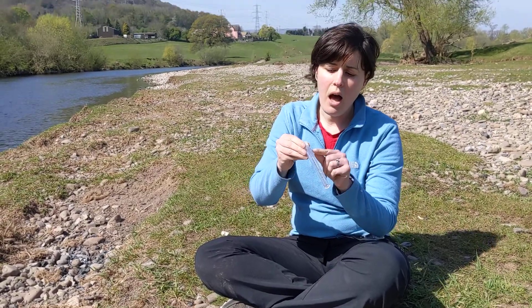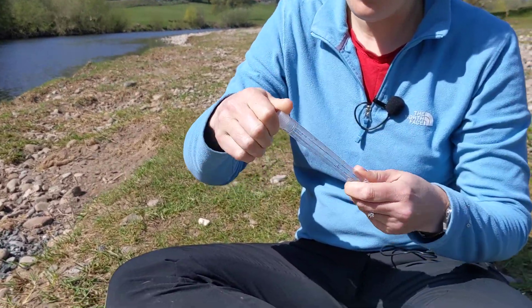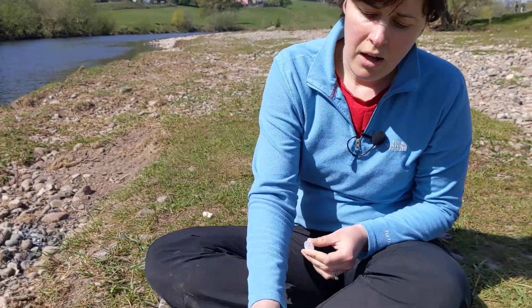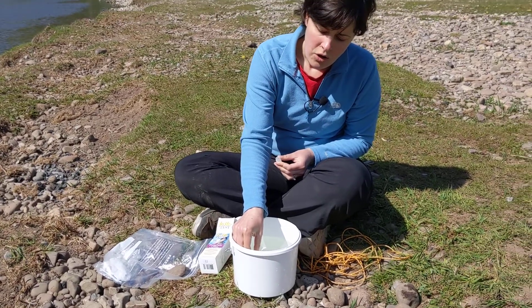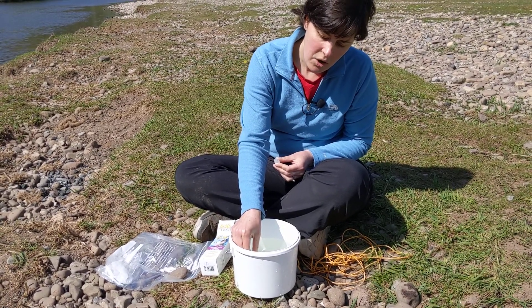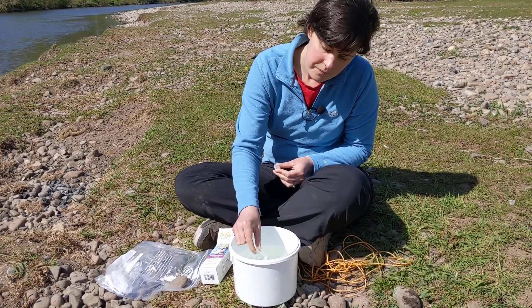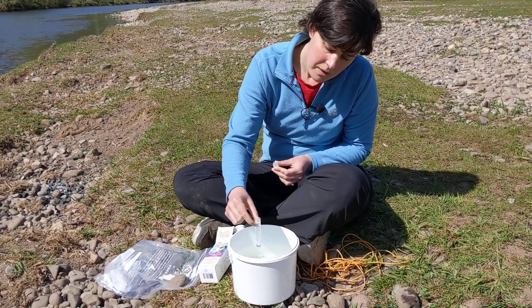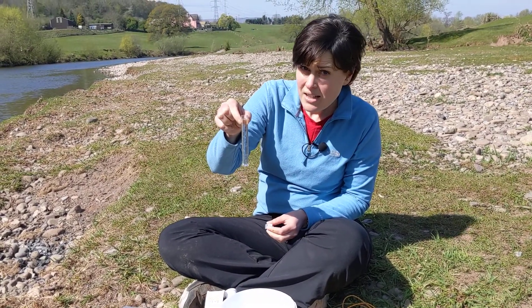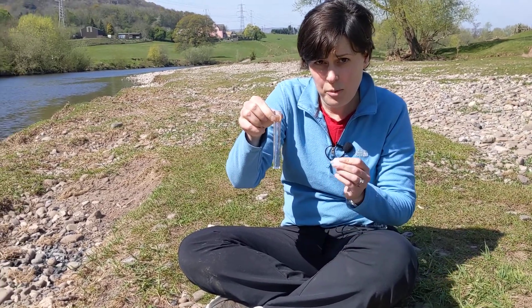Fill the test tube up to the top line either using a syringe or if you've got a big sample bucket you can just gently fill it up, avoiding dunking your whole hand in the sample. If you go a little bit over or under the line it's not the end of the world — you just need to make sure that your test tube is full.